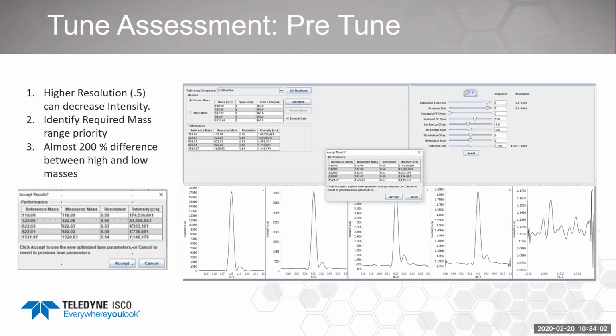The other thing that might happen is that you don't have enough material going into your source. Do you have a blockage? Do you have a partial restriction? So if it's not actually seeing enough material or response, ionizations might not be strong enough for some reason. At that point, if you get a failure and it's not the cleaning, we might have to start looking at some possible failures in the hardware itself.